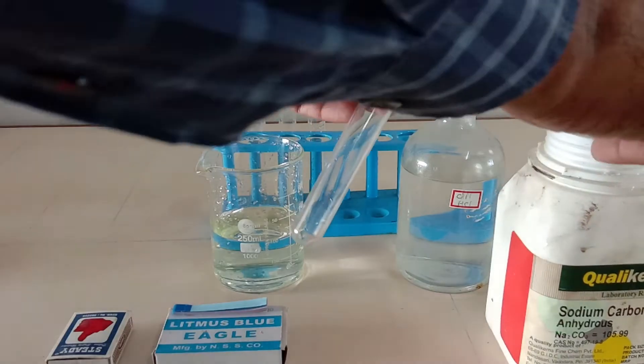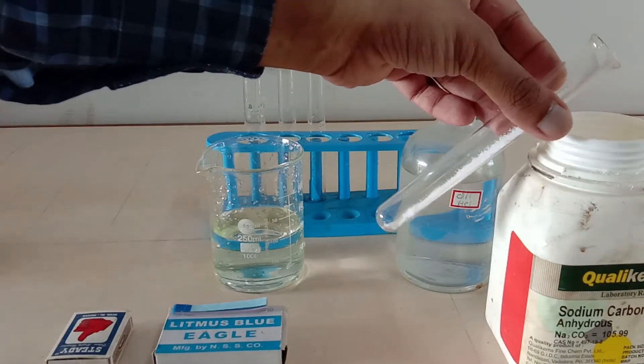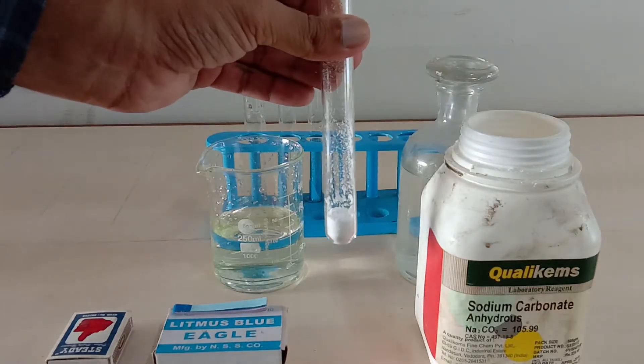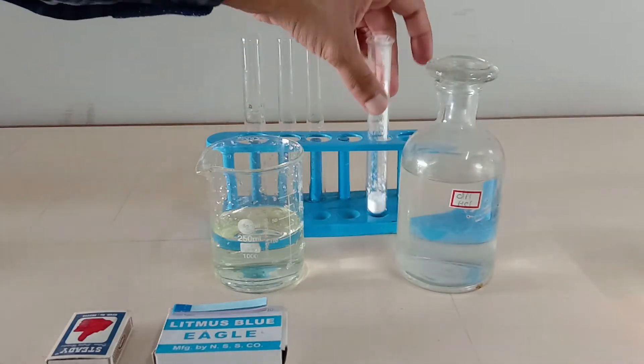Now I'm going to collect, with the help of a spatula, sodium carbonate into the test tube, and then I'm going to add dilute hydrochloric acid to it.